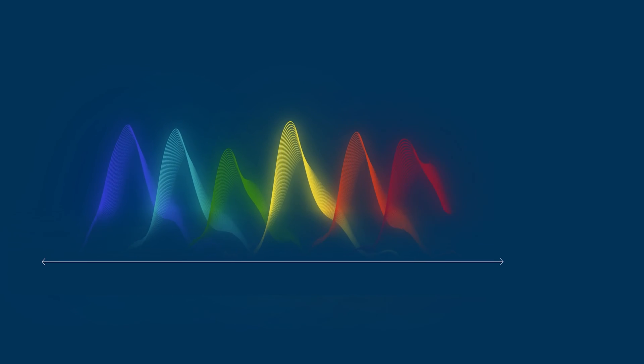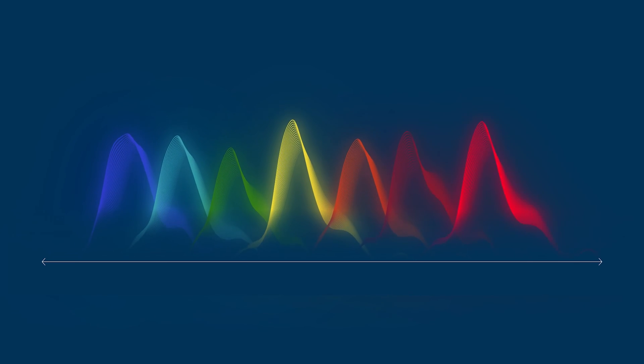Let's talk colors. NIYO Plus is the first digital PCR instrument to support seven colors, with a brand new Long Shift Red as an extra color.